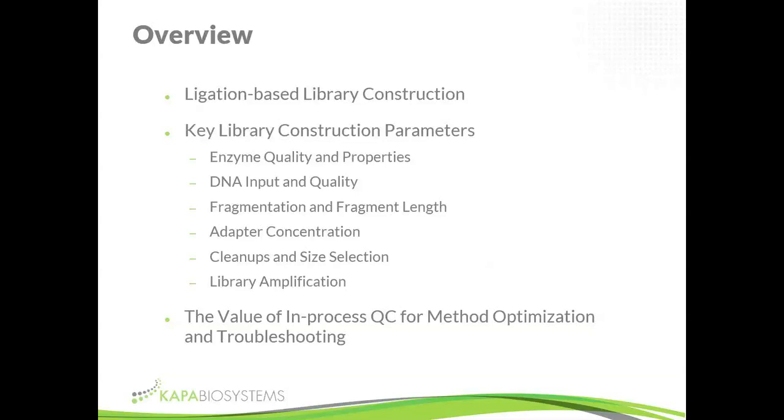from your available sample. We'll end this part of the series by looking at some in-process QC and the value of doing some additional QC to help you initially optimize your method, but also gather valuable information for troubleshooting if things go wrong, which they always do. So let's look at ligation-based library construction in a little bit more detail.